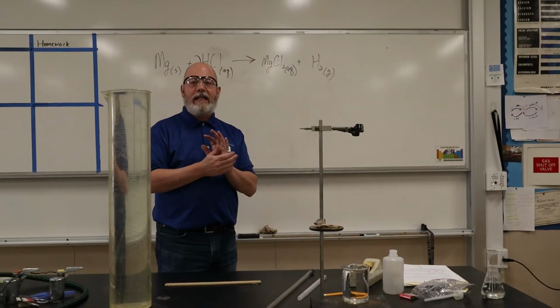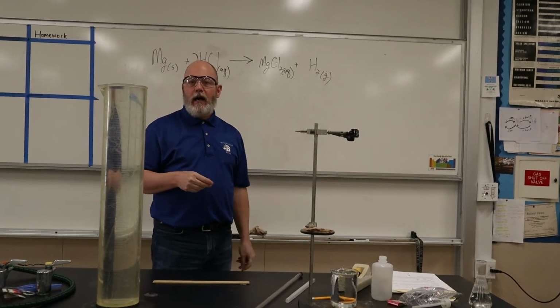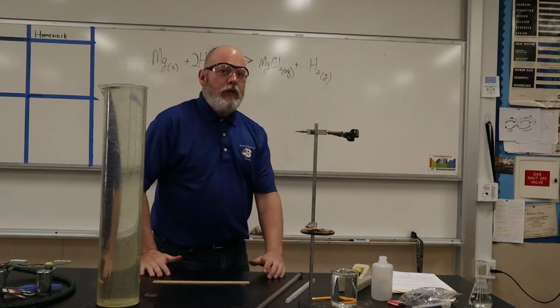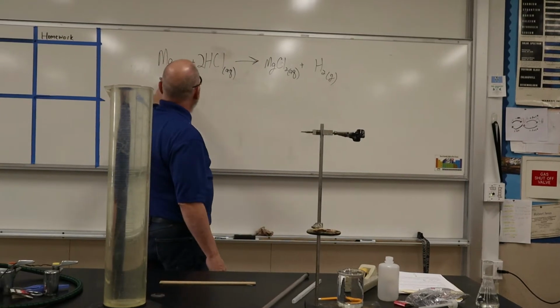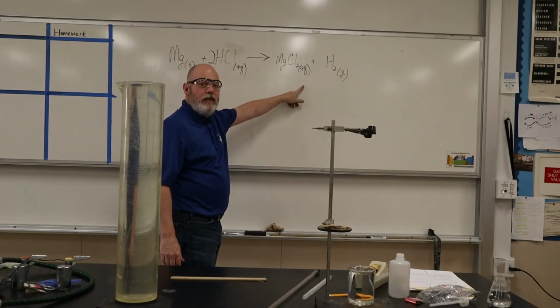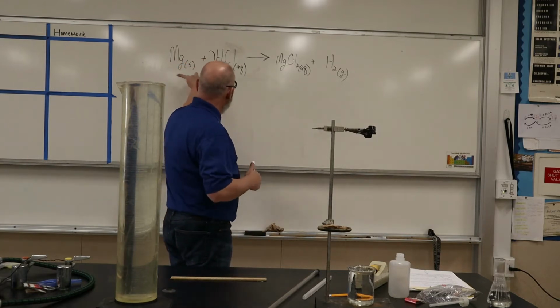Boys and girls, back for another edition of Burbank High Chemistry Labs. This is one of my favorite labs. What we're going to do is this single replacement reaction. Remember that from first semester? Now, if you remember, one of the labs we did was this reaction.